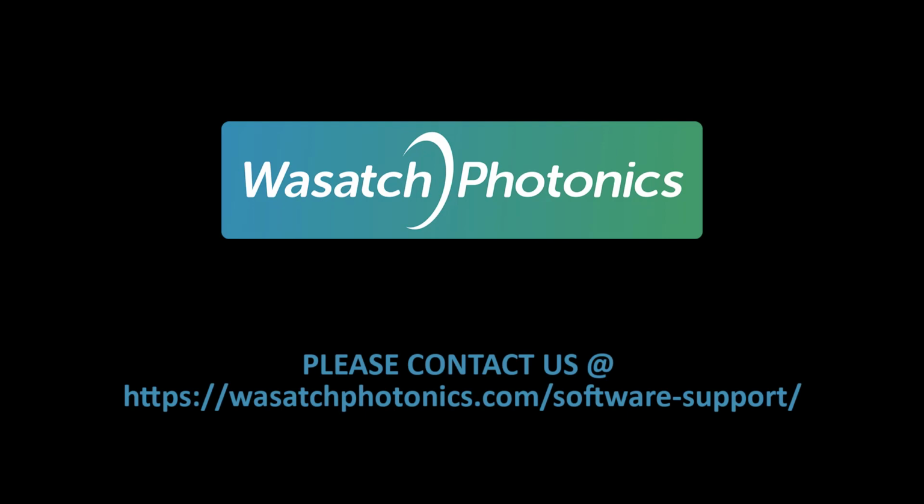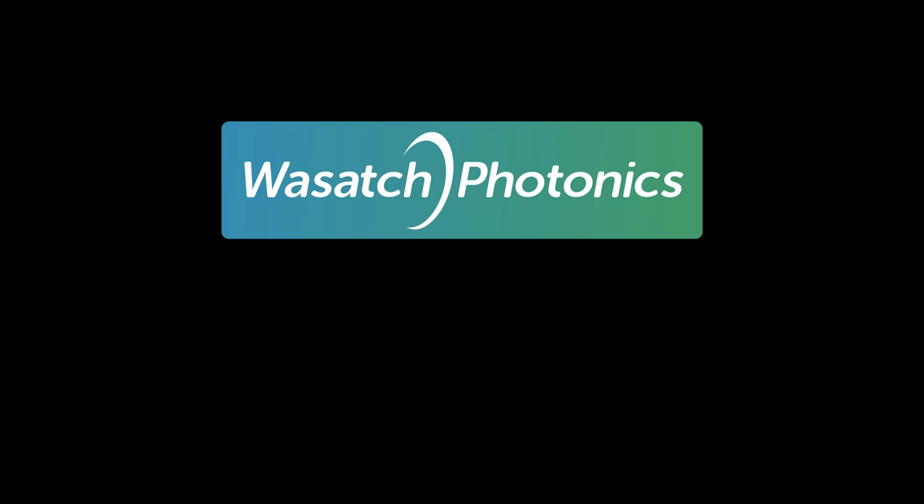We hope that this was instructional in helping you better understand dark and reference measurement best practices and collecting emission measurements within scope mode of the ENLIGHTEN software.